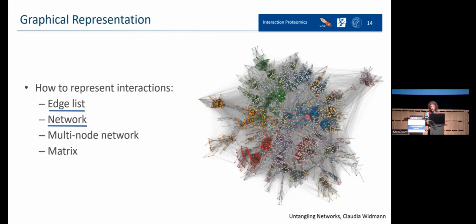But this is also to show you about networks, to be aware that putting too much information may result in a network that doesn't carry any more information because it's too messy. There are too many things to look at, and everyone who looks at this image is not going to understand anything. So when graphs have many, many nodes, so many dots in the network, they are called hairballs, like a ball of fur that you can't see anything in, and you should untangle it to try to understand its meaning. But let's go with the first two of this list.